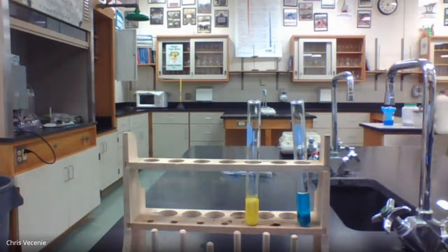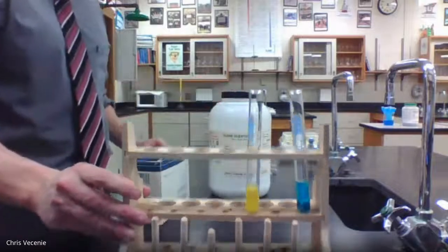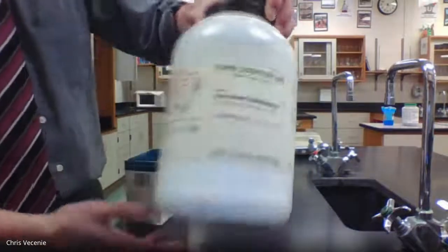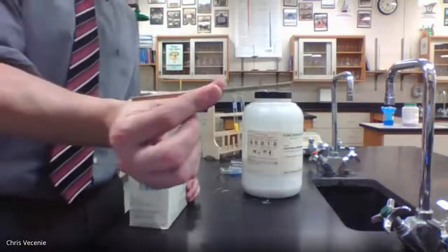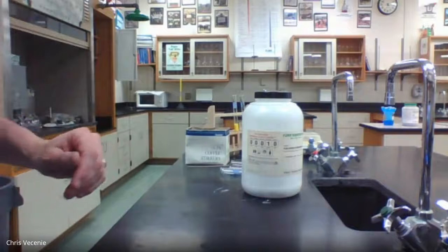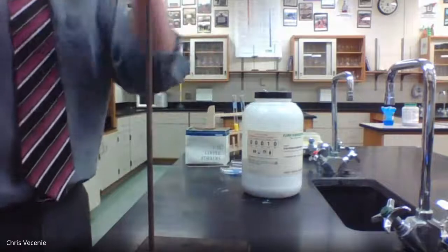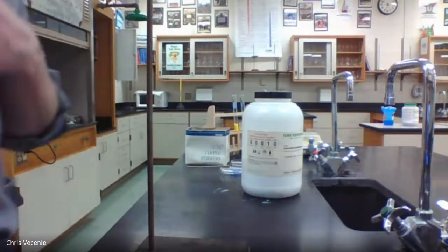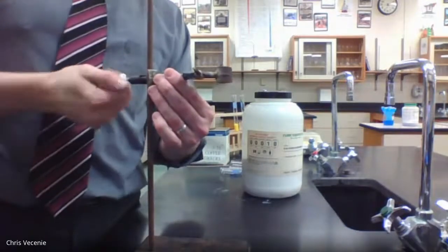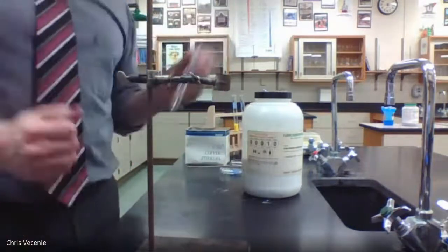Reaction number 3 involves calcium carbonate. I have a big jug of calcium carbonate here, and I'm bringing over just a wood splint. I'm going to take down my ring stand, take off the iron ring, and instead put on a test tube clamp, because what I want to do is hold a test tube here above a Bunsen burner.